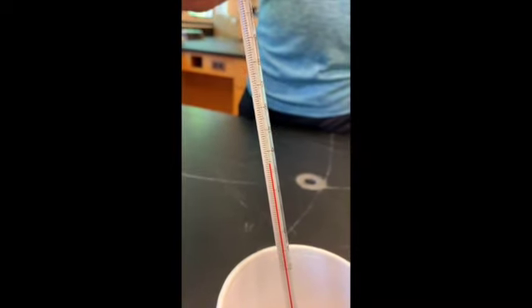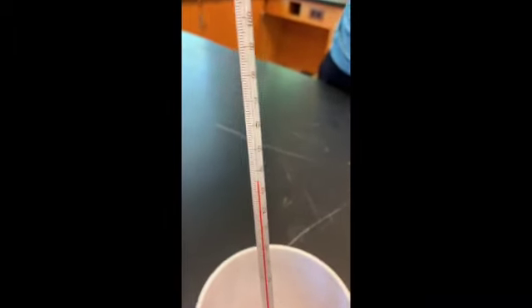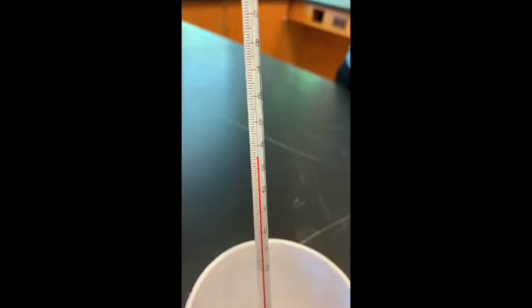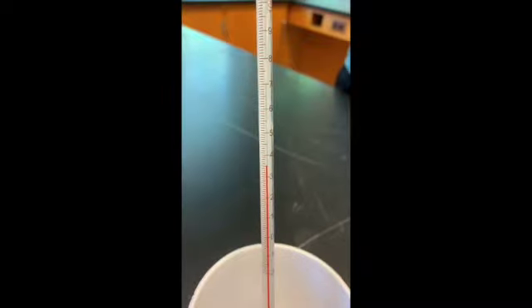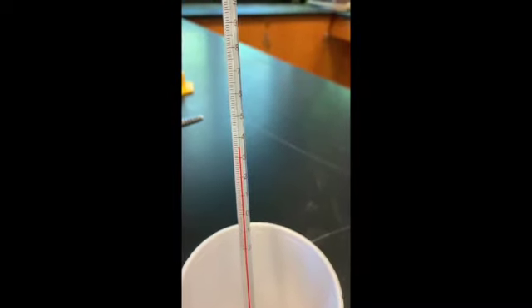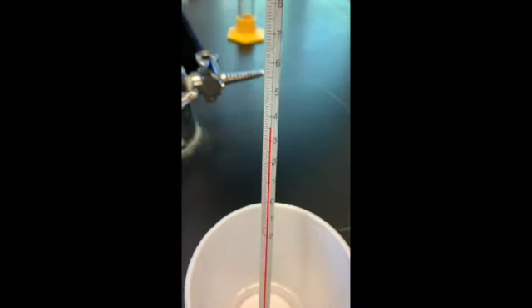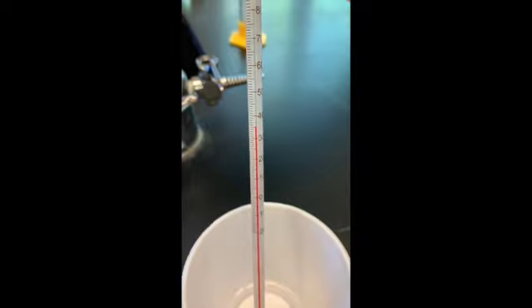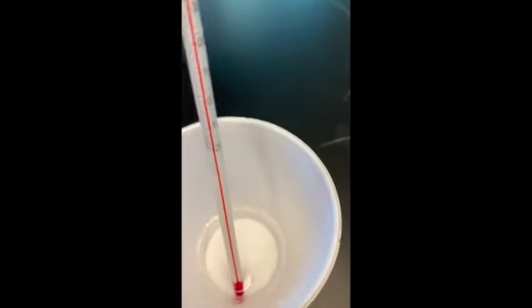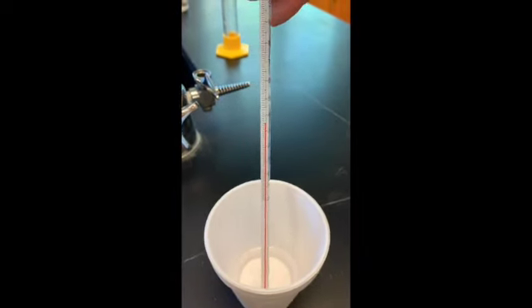I just twist it that way a little bit. Perfect. All right, now we're coming in and out of focus. So we're looking to record the highest temperature reached. Once that temperature starts going back down again, we know we have reached our highest temperature. And this reaction is giving off energy because it's increasing the temperature of the hydrochloric acid. It looks like that is our highest temperature reached. And if we look in, all of the magnesium has reacted. And that is it for reaction number 1.